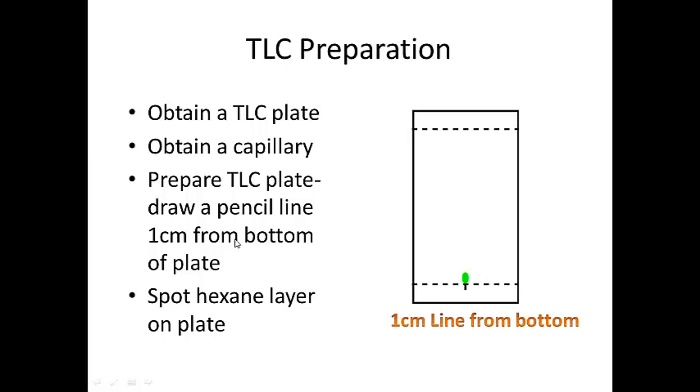You want your spot of the hexane layer to be above the line and not below it, because you don't want the solvent in your development chamber to dissolve your spot — that will really mess your TLC experiment up.